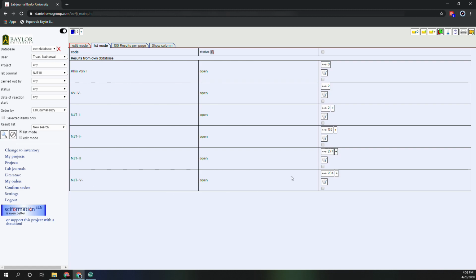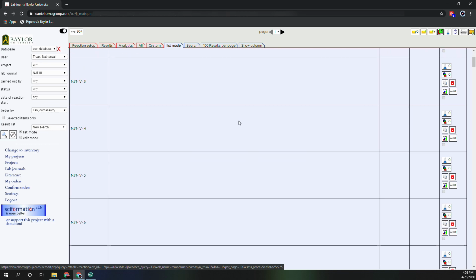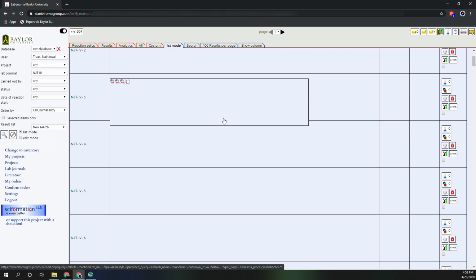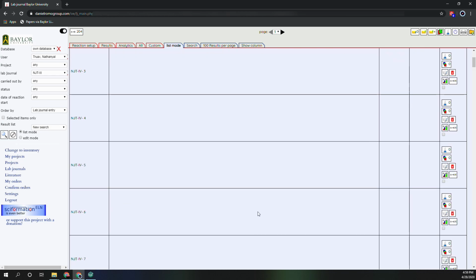So the easiest way from the screen to do this is click on this A to 204, and this will be the reactions or setting up the notebook pages in this notebook. So this will bring up the table of contents of reactions, and so since we did the fill from 1 to the current notebook page, the first entries will be empty. So we're just going to go ahead and set up a dummy reaction just to show you how this process works.